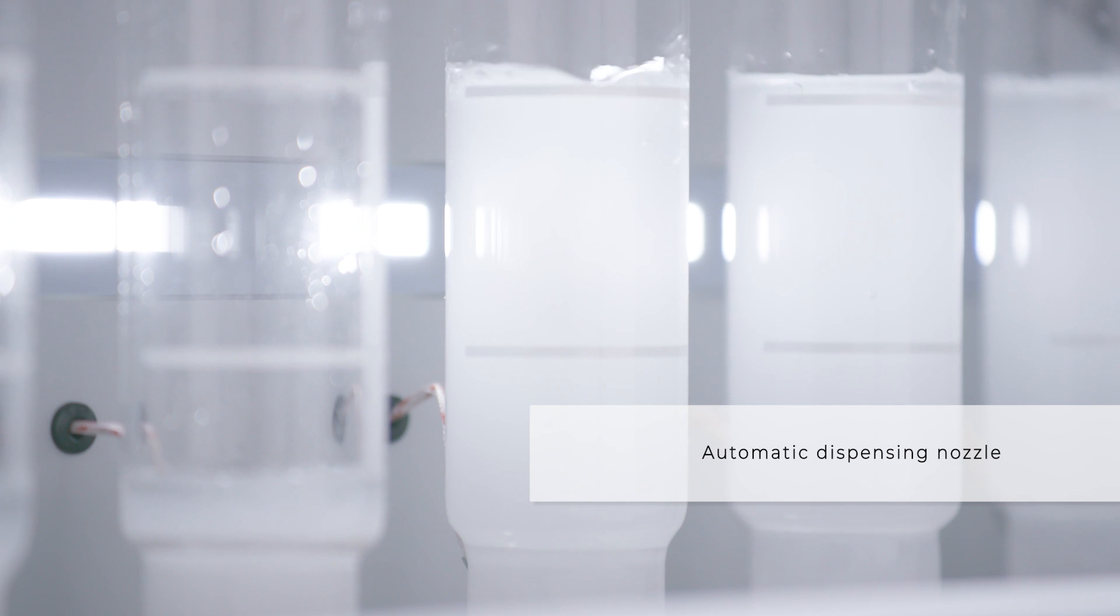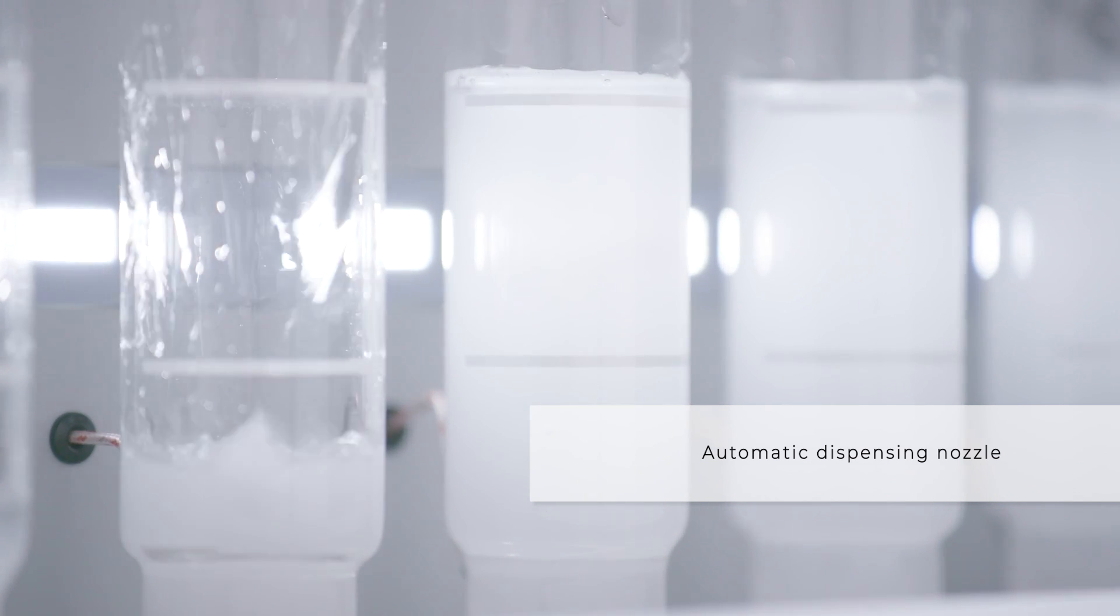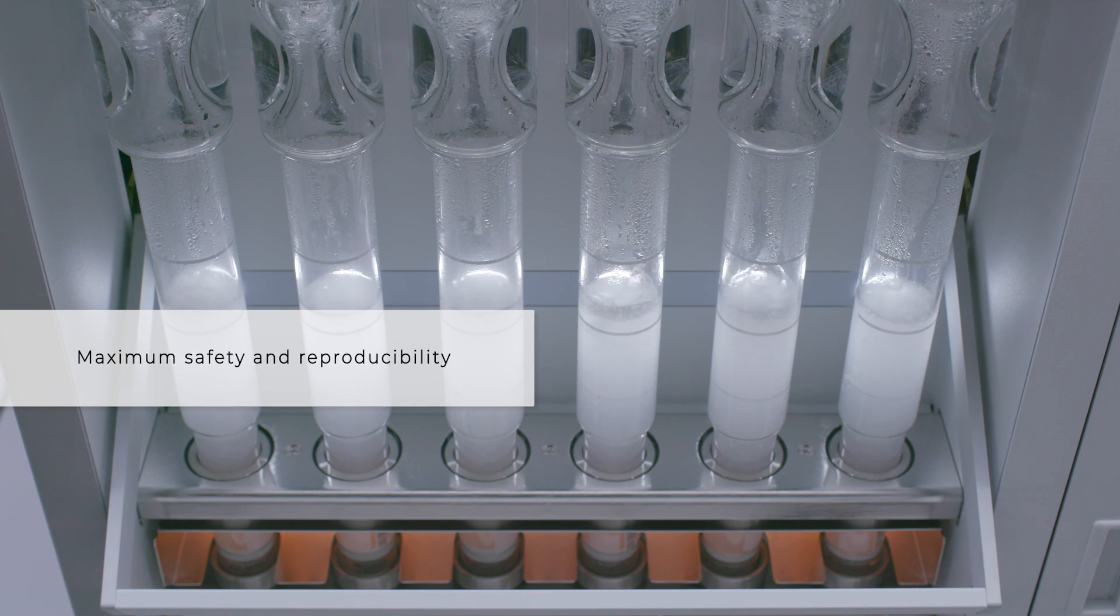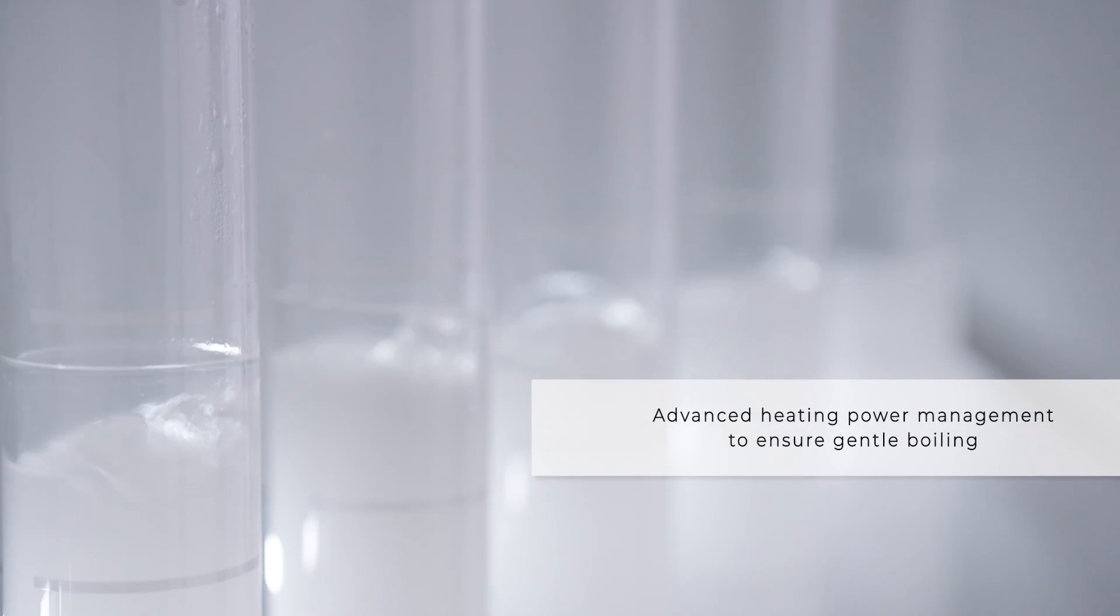The dispensing nozzle precisely doses the chemicals safely into each column when needed according to the chosen method. During the digestion step, the Feeway Advance automatically adjusts the heating power to ensure gentle boiling.